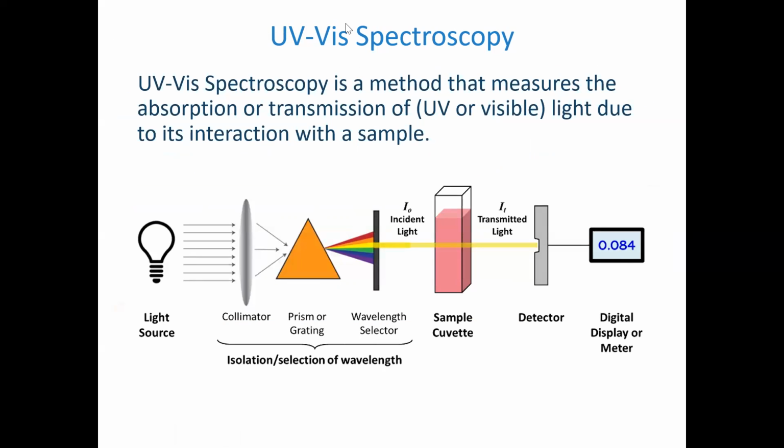So this is the whole idea behind spectroscopy. I'll show you a video here in a minute, but let me explain what is going on here. I guess what I meant to have is this animated a little bit, so you can see part at a time. But here's the idea behind spectroscopy: you have a solution, and there's a molecule in there, and it has a color. And we can use an instrument to detect that color. And why is this useful? We'll talk about that in a minute.